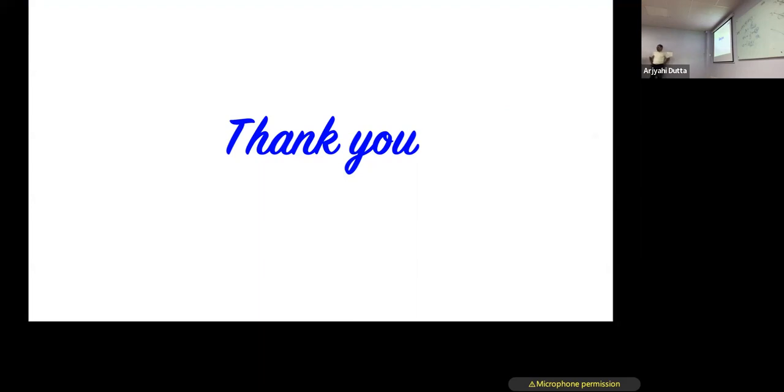So, let's say many times we want to see what is going on with respect to time, like live video. Here we are freezing the sample, so we are not able to see what changes with respect to time. Yes, because whenever you freeze a sample, in that particular moment, if there is a different conformation, we trap that one.